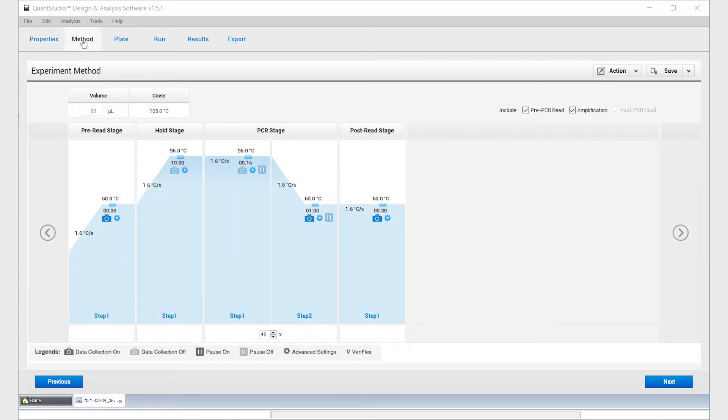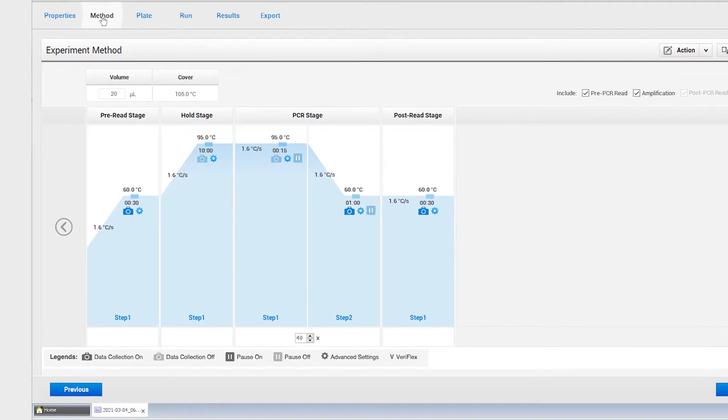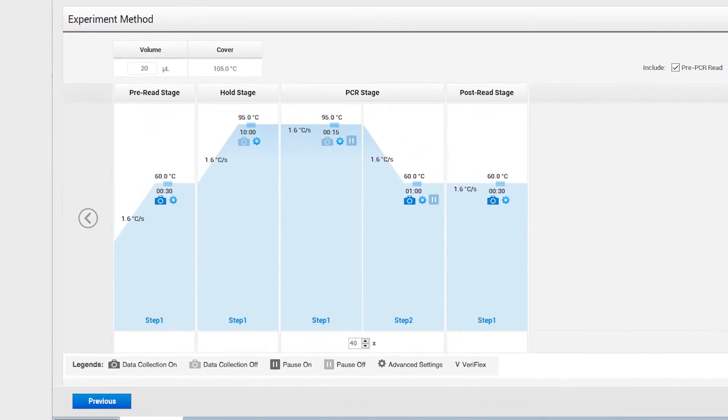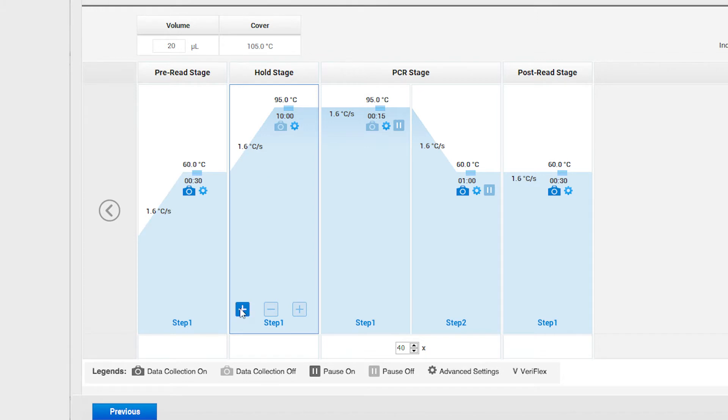When setting up the thermal profile, you must add a reverse transcription step. To do this, add an additional hold stage by hovering over the current hold stage and clicking the plus button.